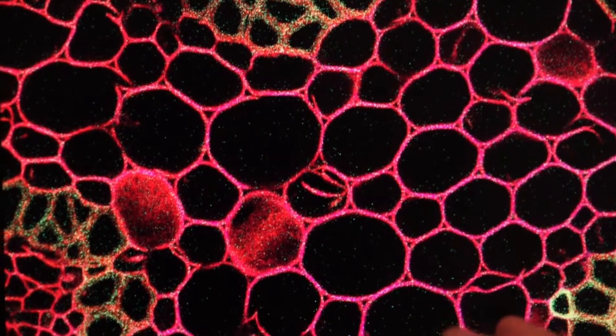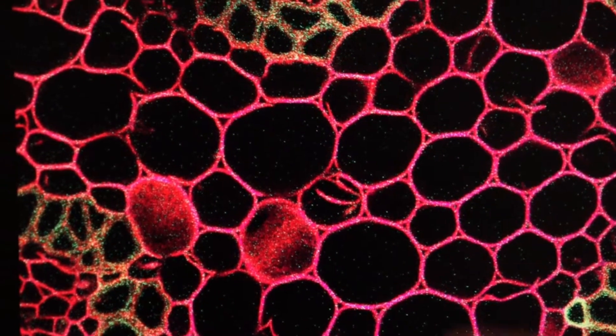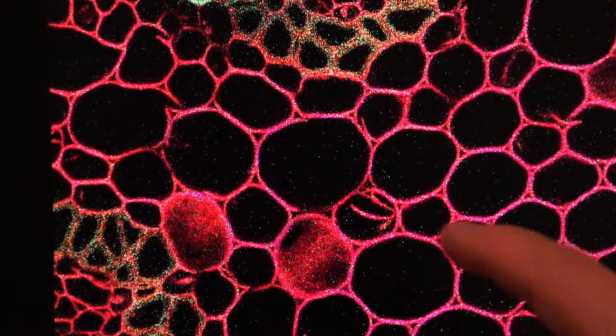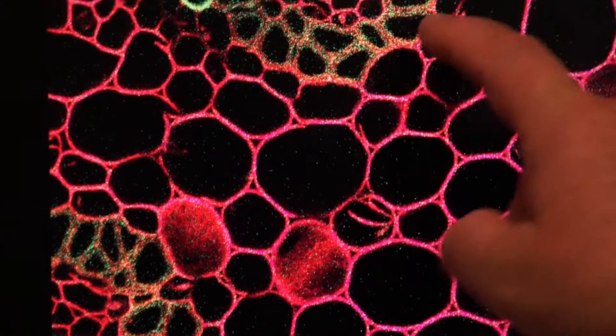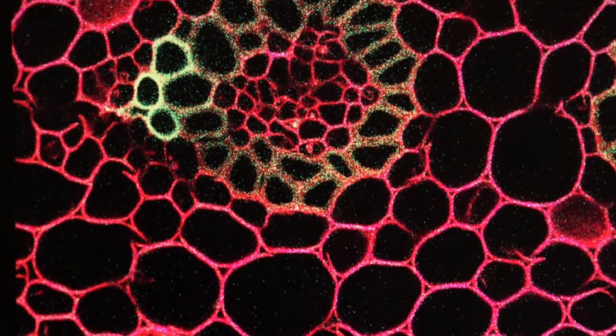Well, again, there's noise in the system. And so by using line and frame average, we can eliminate some of that noise, reduce some of this pixelation, and increase the resolution of our image.